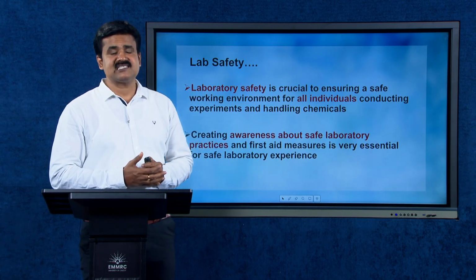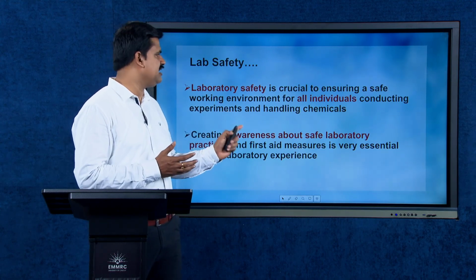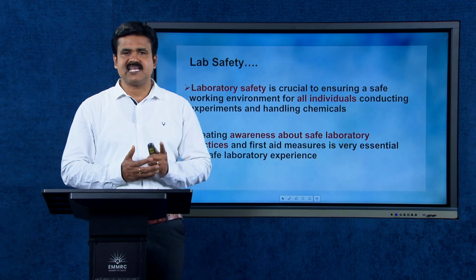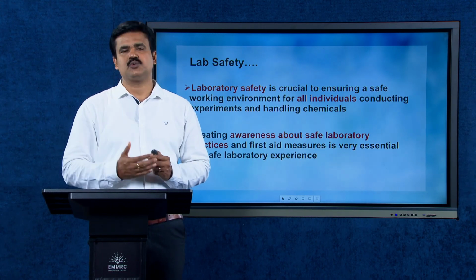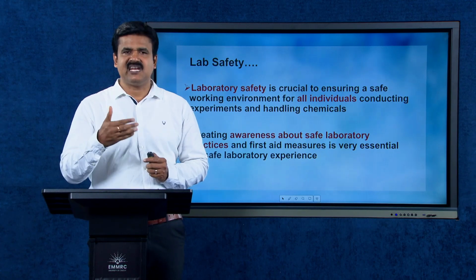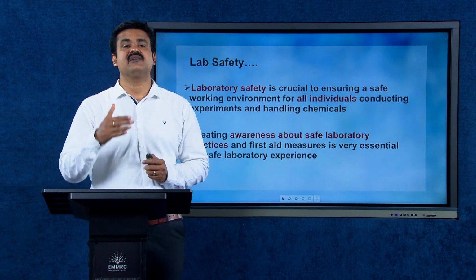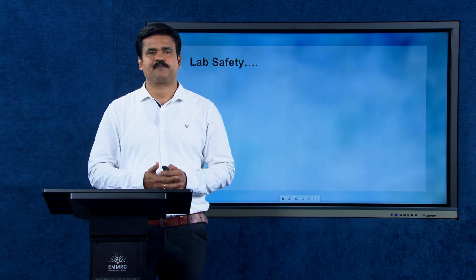Creating awareness about safe laboratory practices and first aid measures is very essential for a safe laboratory experience. That is, we all should know about the lab safety measures that we have to adopt whenever we are doing experiments in a chemistry laboratory.